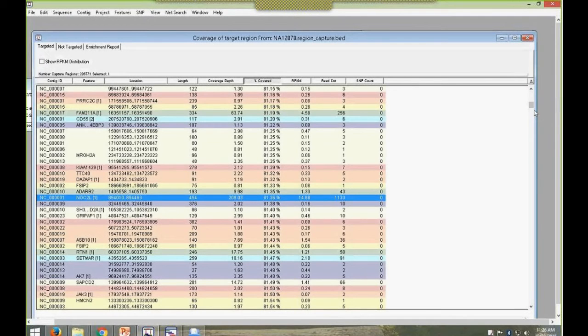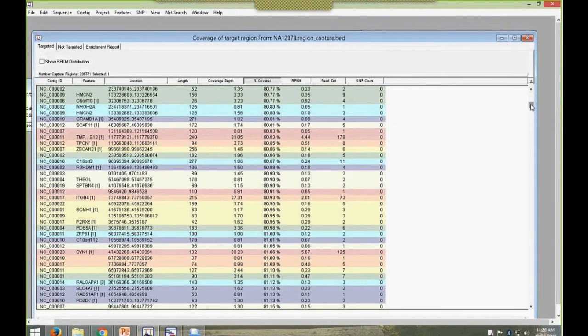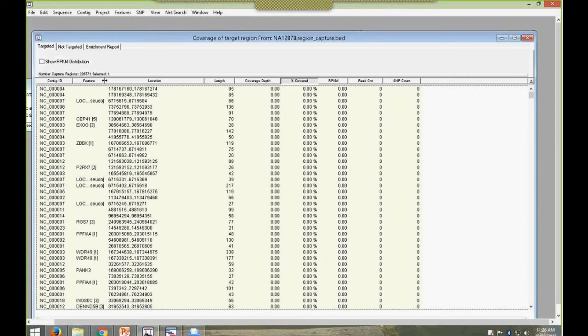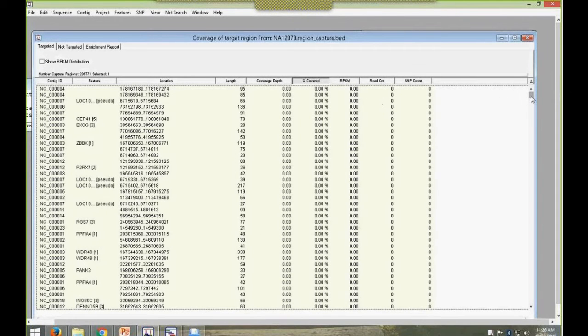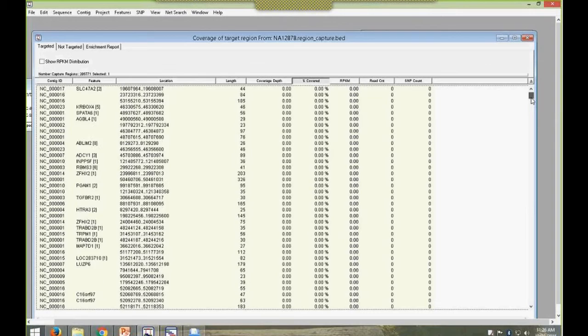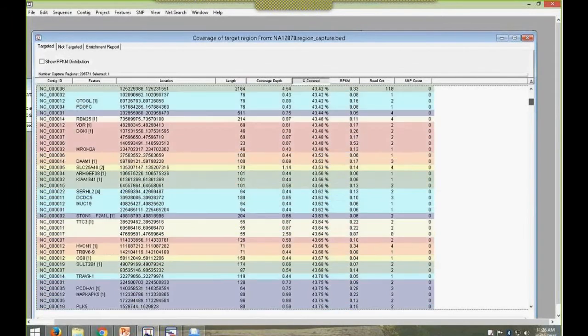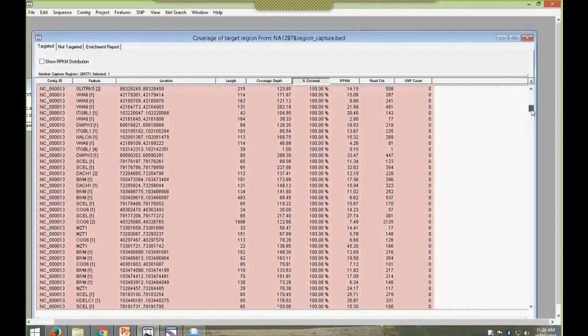There I sorted by percent covered. And I can see, again, this is an exome. Here's all the targeted areas that have 0 coverage. And I'm just going to scroll down, so keep an eye on when we start getting covered areas. So I'm scrolling down. There I've got coverage, and right about here I'm at 100.